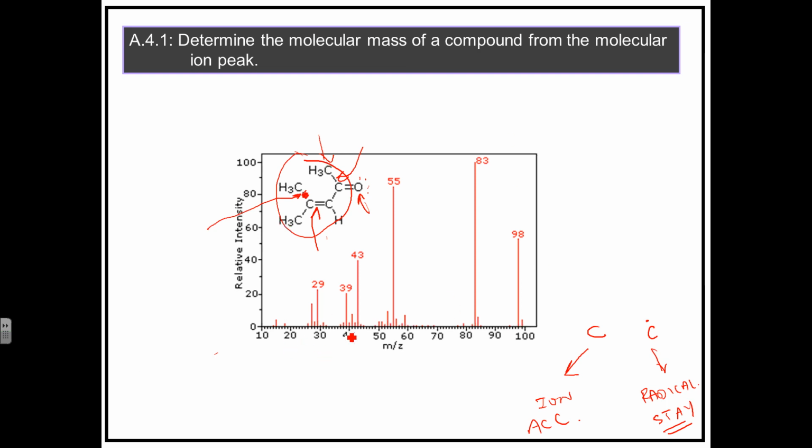This graph shows all the bits that have come through the mass spectrometer as the molecule gets broken into pieces. So let's study some of the bits. This bit on the far right is called the molecular ion peak. So quite likely what's happened to make this ion is one of these non-bonding electrons on the oxygen has been knocked out. No bonds have been broken, and consequently the molecule has come through, and it's just an ion now. So this tells us the molecular mass.